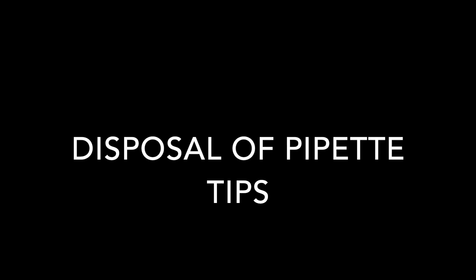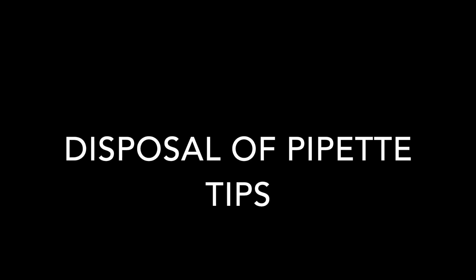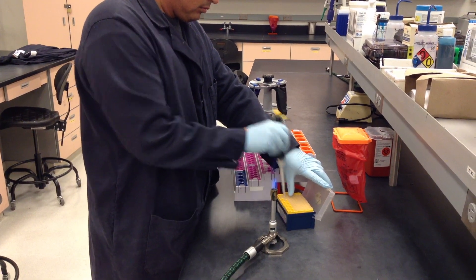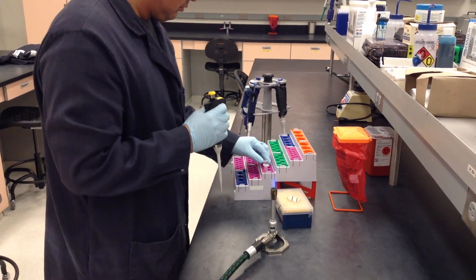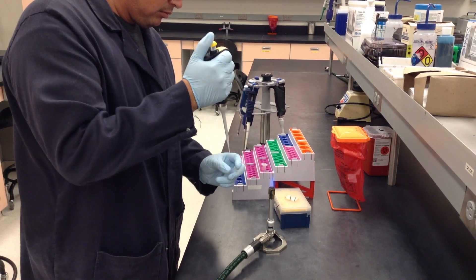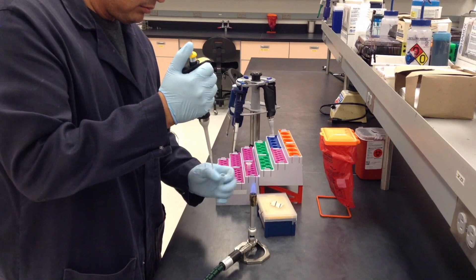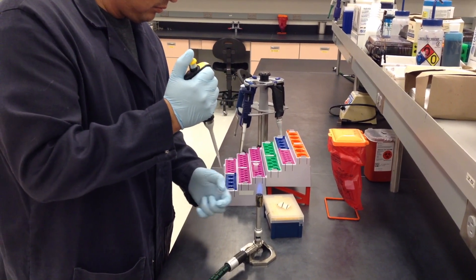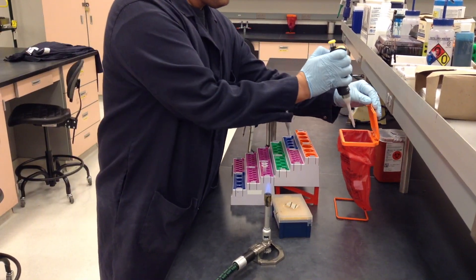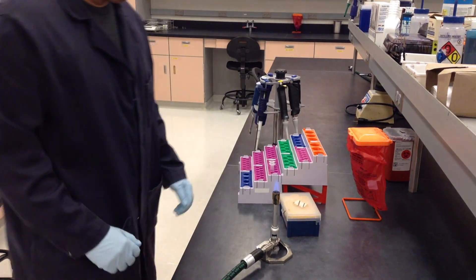This course will teach you how to aseptically transfer media and bacterial cultures from one container to another. Micro pipettes will be commonly used to do that. Working near the flame, open the pipette tip box, pick up a tip, close the box lid, and transfer the sample. Once you have aseptically transferred your samples, eject the micro pipette tip into the small plastic biohazard waste bag located on your bench top.